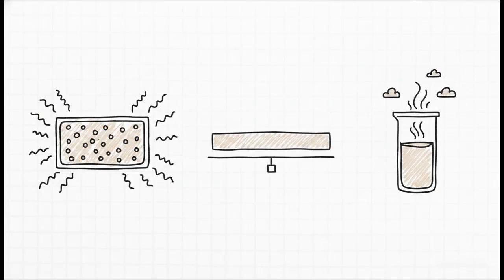Of course, in the lab, things don't always go according to plan. If your transmission rates are too low and your readings are failing, the most common fix is surprisingly simple. Just reduce your sample concentration. Remember the limitations of the Beer-Lambert law? A super concentrated sample is just going to scatter the light. Also, double-check your hardware alignment. If you're measuring a thin film, it has to be perfectly perpendicular, exactly 90 degrees to your light source. Oh, and if you're running a long test, watch out for evaporating solvents. Evaporation will slowly increase your sample concentration over time and totally ruin your data curve.